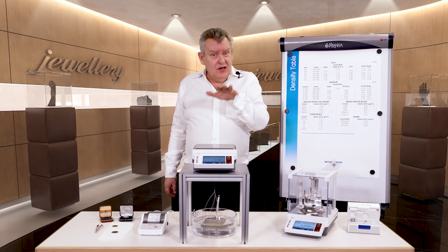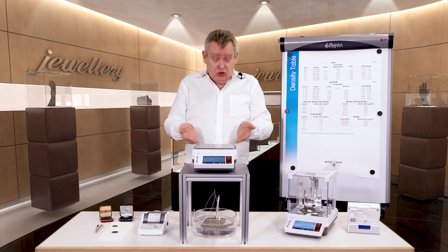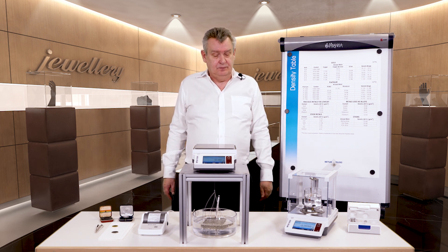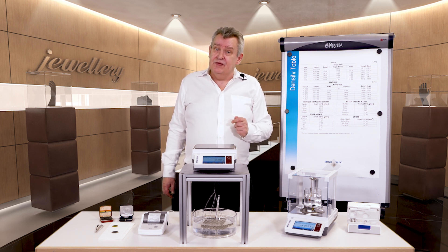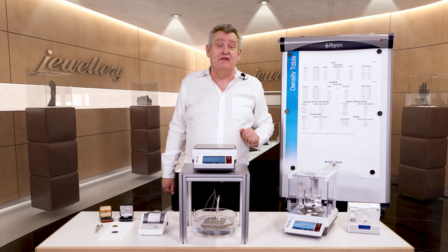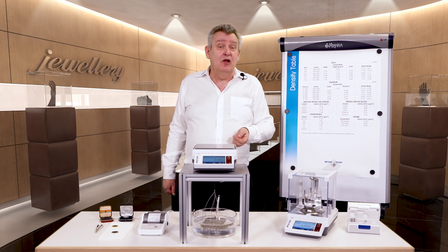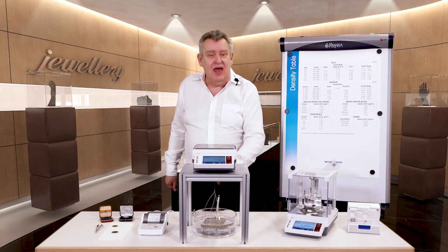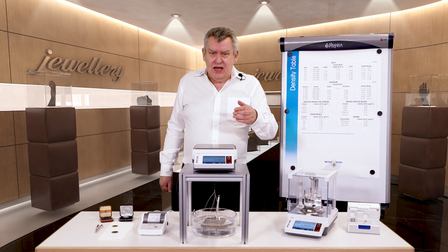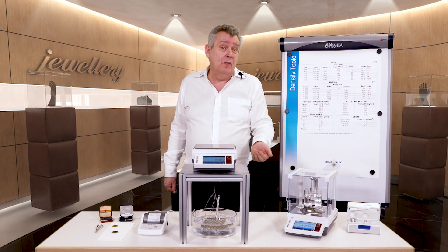Using this type of construction, the balance is still usable for normal weighings — it's not just for purity determination. One of the great features of the Jet Balance is its color touch screen, which is as intuitive and simple to use as your smartphone. Performing the purity measurement is super simple using the principle of Archimedes, simply by weighing the sample first in air and then in the liquid.